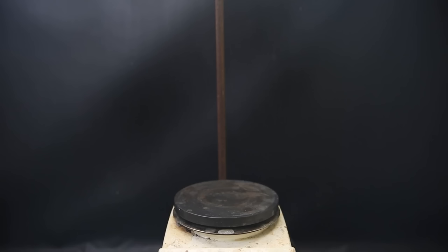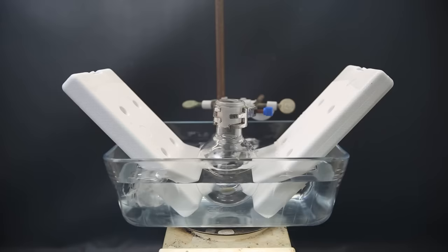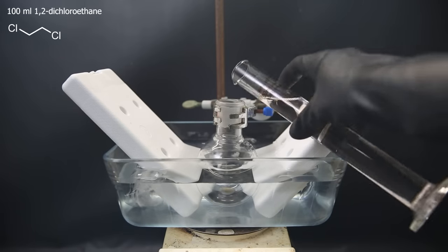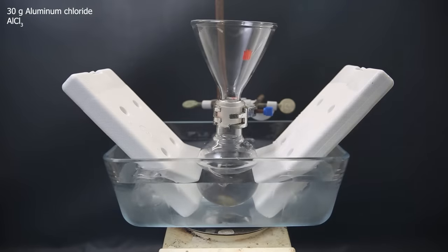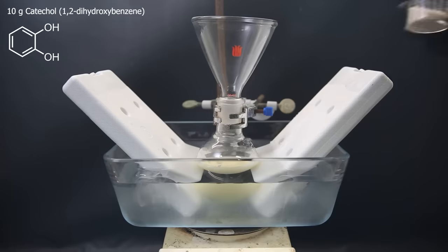So to get started with the synthesis, I set up a stir plate and a flask in a water bath. I add some cooling packs and ice to prevent the reaction from going out of control. I then add 100 ml of 1,2-dichloroethane as a solvent and 30 grams of aluminum chloride as the catalyst.